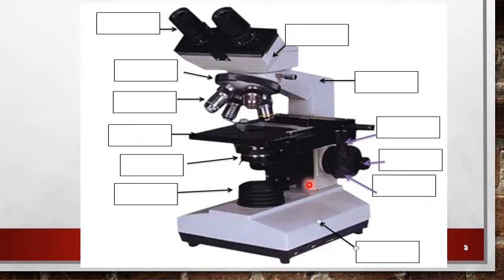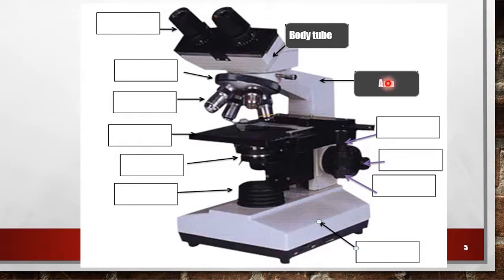The body of the microscope includes body tube, which contains mirrors and prisms that transmit the image from the objective lens to the ocular lens.